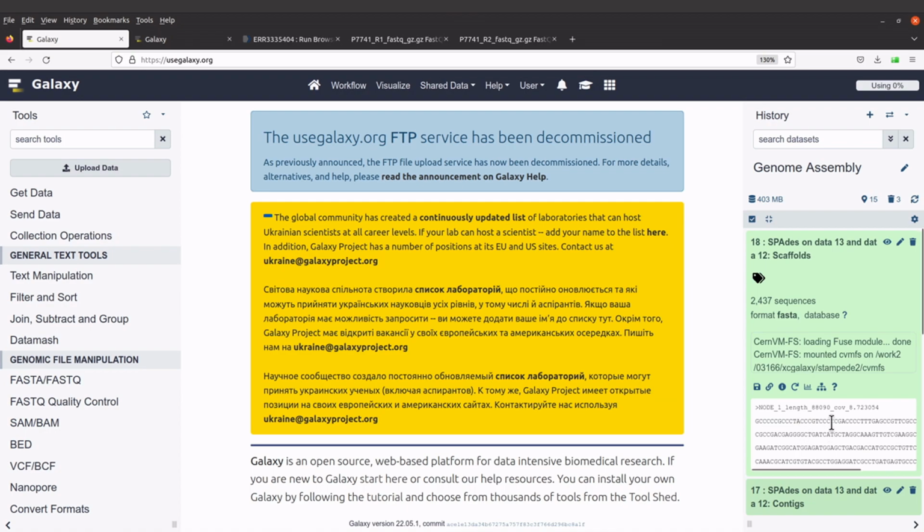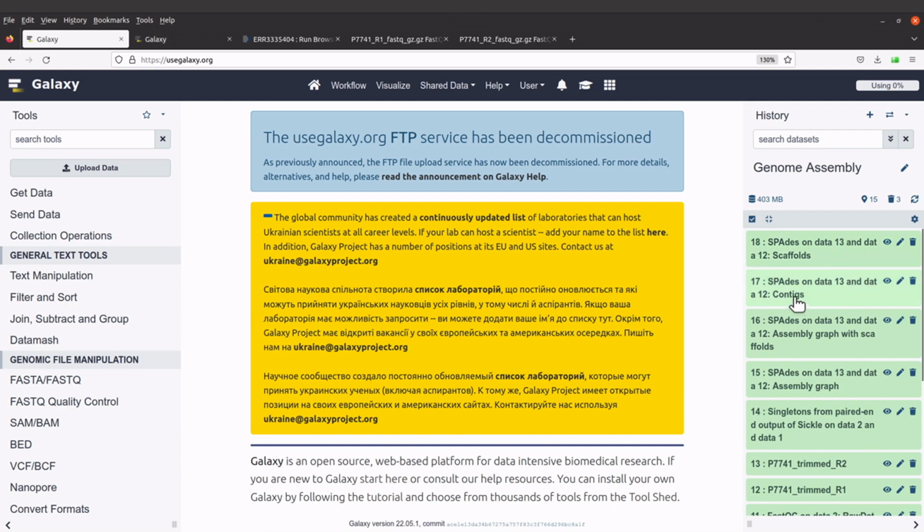a different file. Okay, so we can actually specify some file names so that Galaxy will generate those files. So those files are called stats files. So the stats files, we will have a stats file for contigs. We also have a scaffolds stats file. Okay, so if you had specified those names, then we would have had our stats files generated for us. So let me show you how to do that.